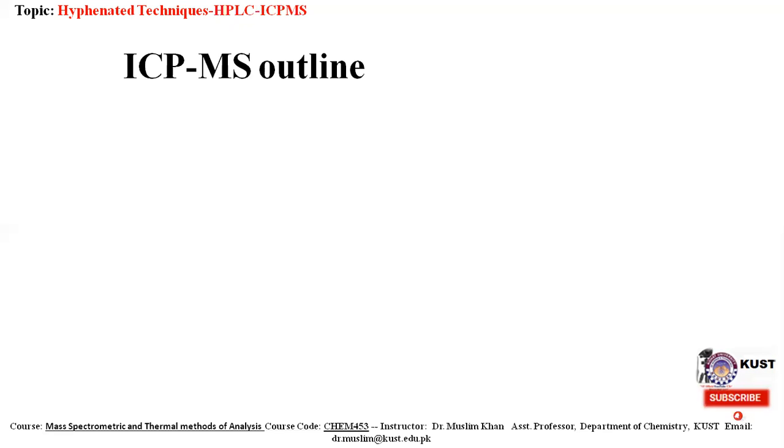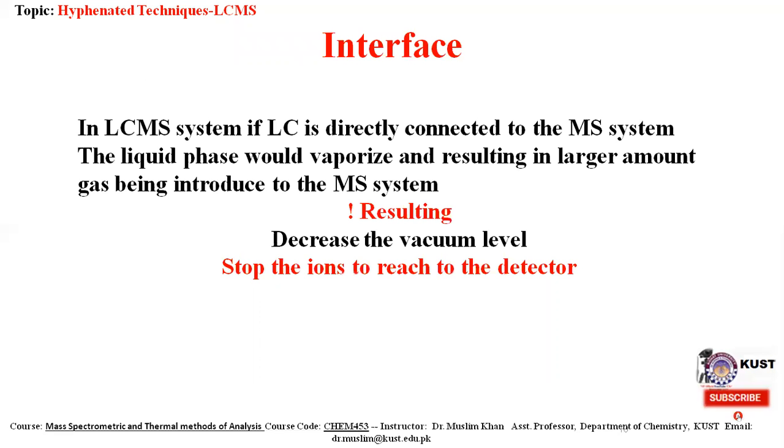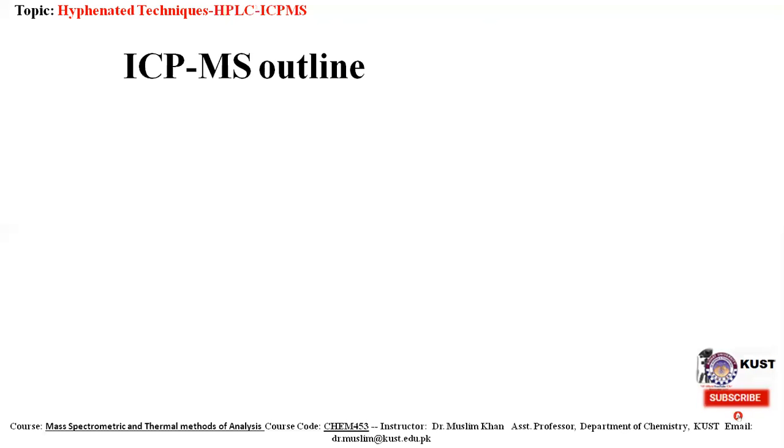So when this HPLC is connected to ICPMS, in one of the lectures we have already discussed these two or three slides for the HPLC system. But HPLC connected to ICPMS, we haven't discussed the ICPMS system. So coming to the HPLC-ICPMS system, we will discuss the ICPMS system in more detail.